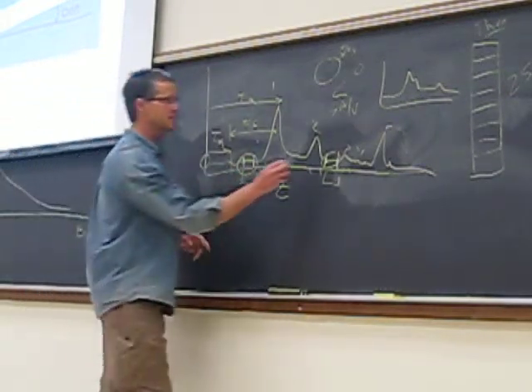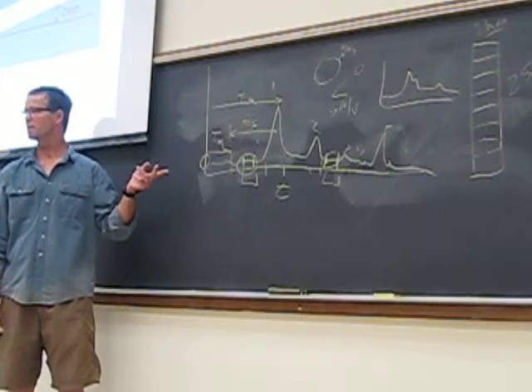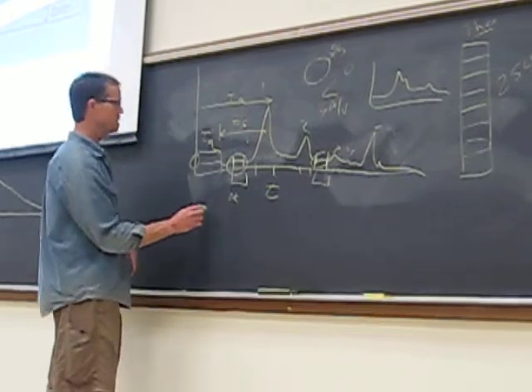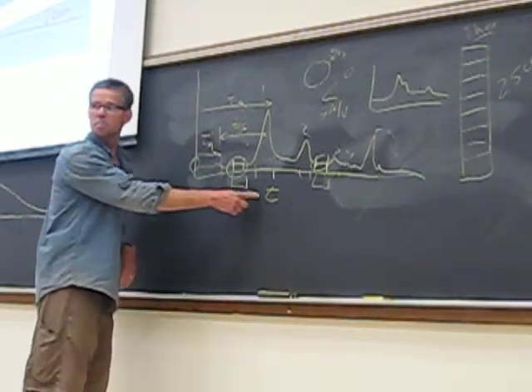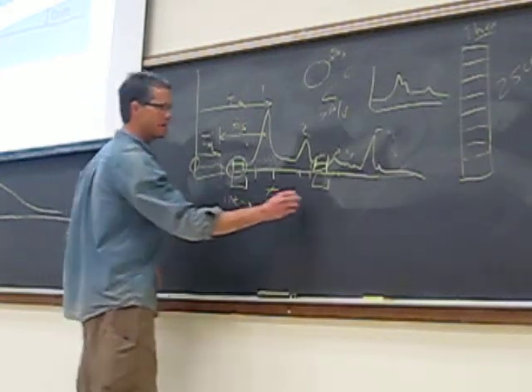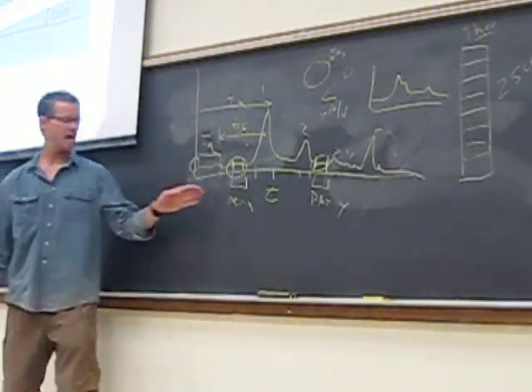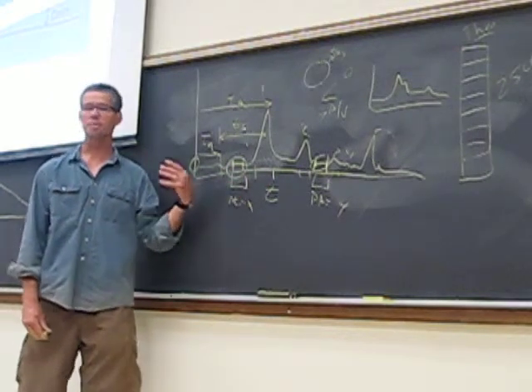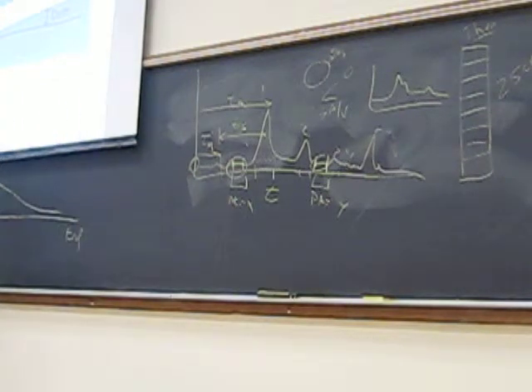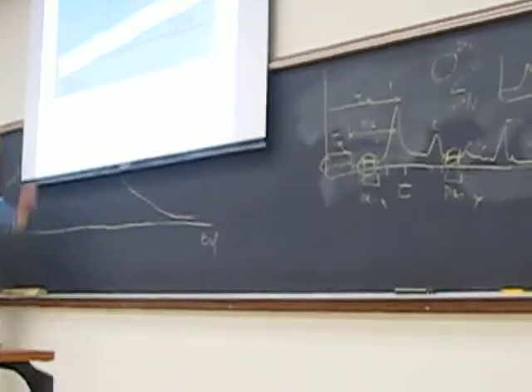And if you did it in a couple of places on the chromatogram, and you have to plan this ahead of time, because you can't go back into the chromatogram easily, then you can say, all right, my peak area, which has the units of microsiemens-minutes, over here is going to be some number, and over here is going to be some number. Maybe they're very similar, probably, and I might be able to do that over one or two different chromatograms. From that, I can just take that peak area and multiply it times 3 to estimate a detection limit based on this approach.